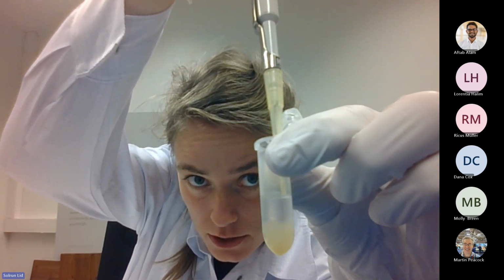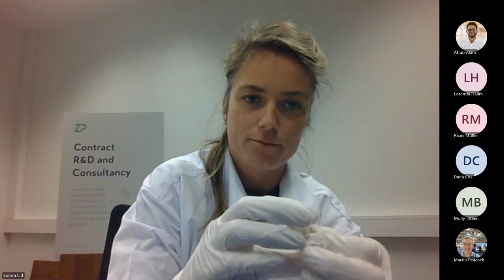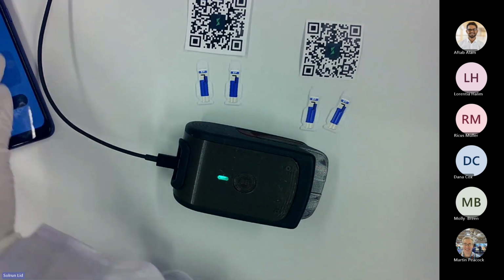So you see it mixes fairly well. And then I will just mix it real quick like that. And you see that it's fairly homogeneous, but I will also cheat a bit by using a vortex over here. So now this is good. So the next step is to connect the device itself.